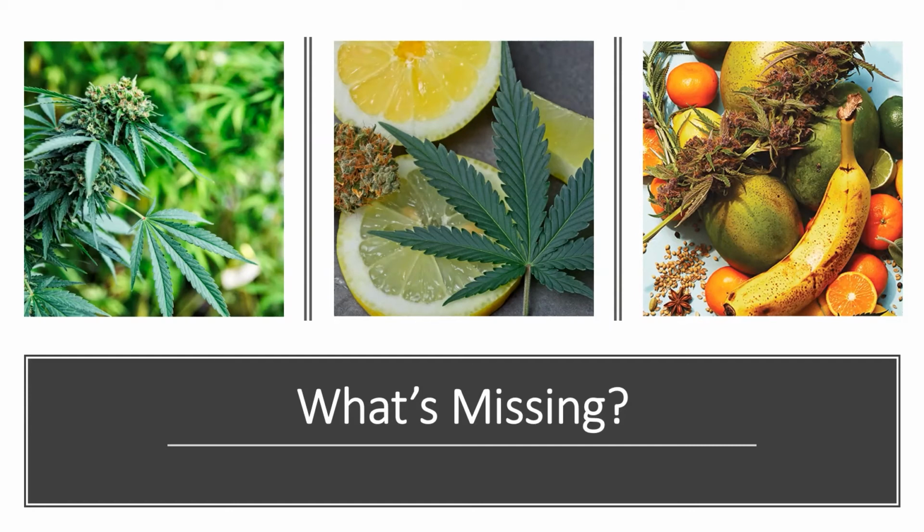And the answer to that question is simple. There are several other compounds present that are not being considered when calculating total loss. The methodology we use internally for potency and terpenes does not include all of the potential compounds that exist. Additionally, the laboratory does not run the samples for flavonoids or other fats and oils that have semi-volatile properties. And we know that those compounds also make up a decent percentage of the cannabis bud and must be considered when trying to measure the true water content in cannabis.